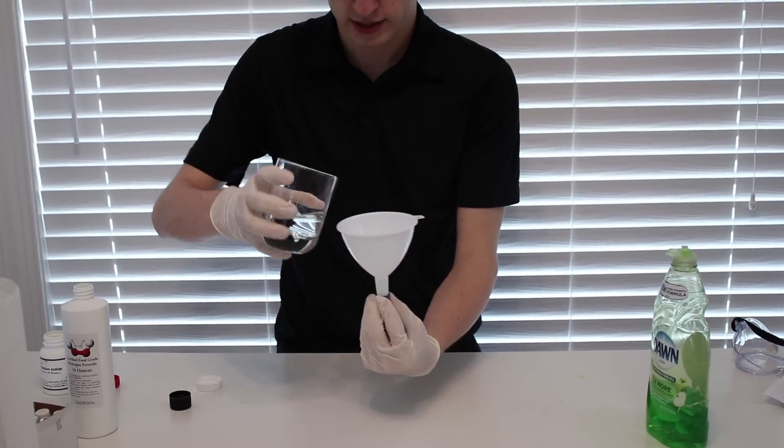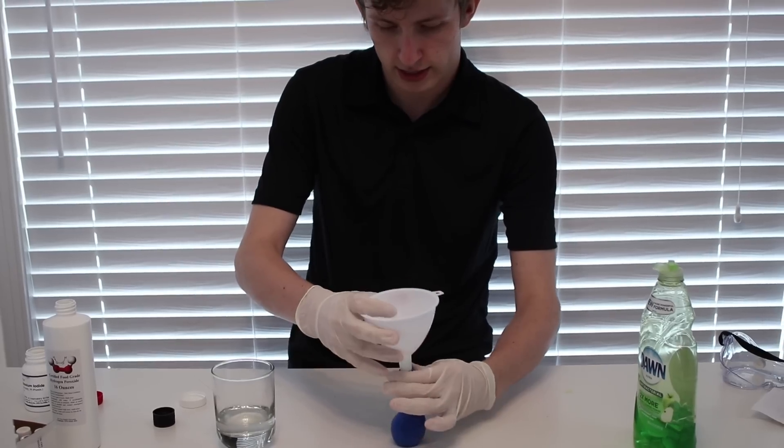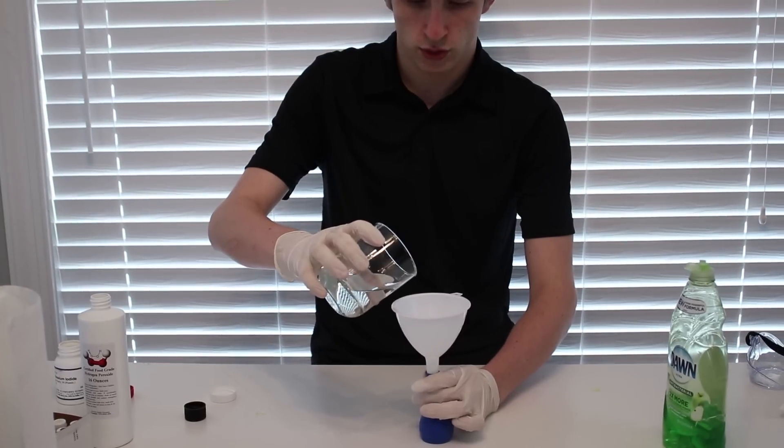Maybe not the smartest thing to do. I don't know how to hold this properly. I'll put this on the ground like this, and then I'll immediately pinch it off. All right, ready? Here we go in three, two, one.